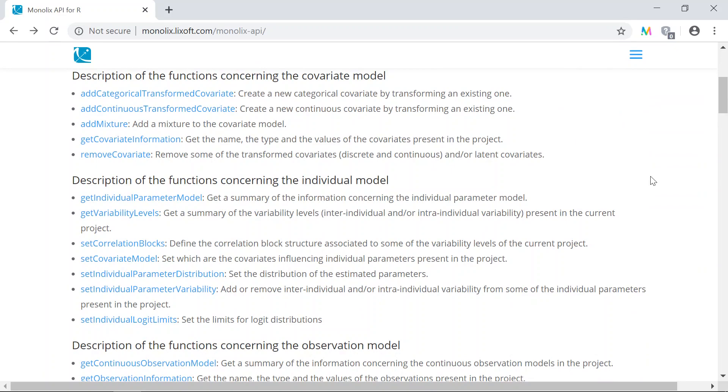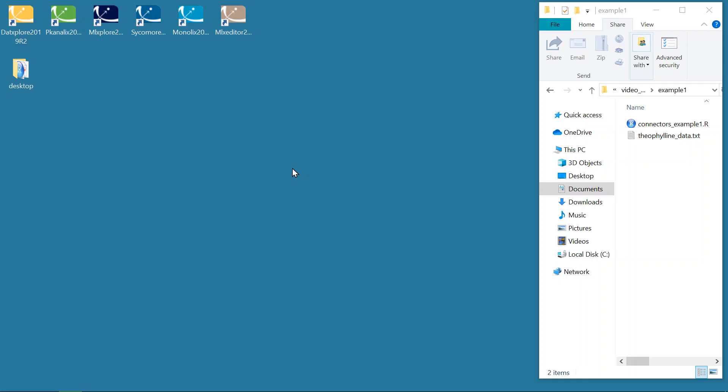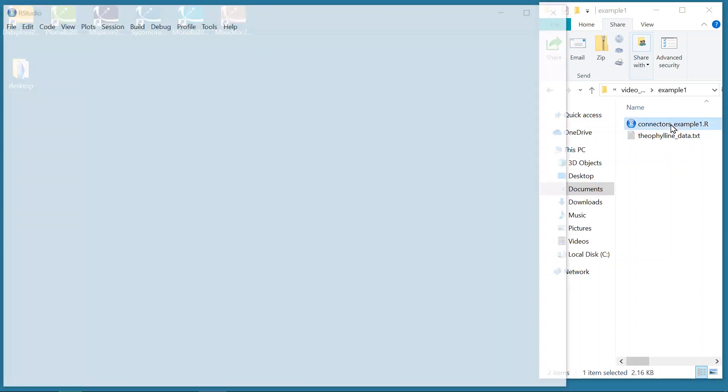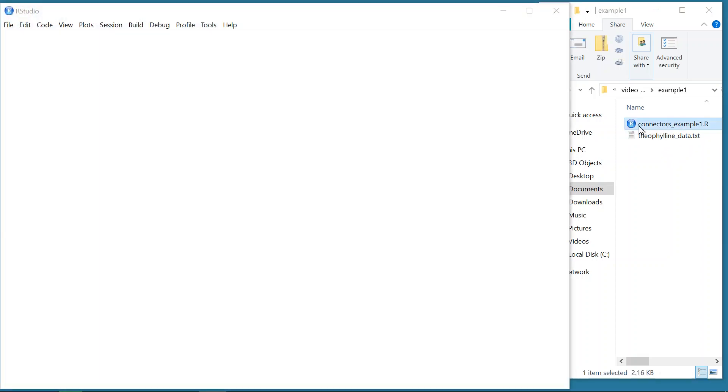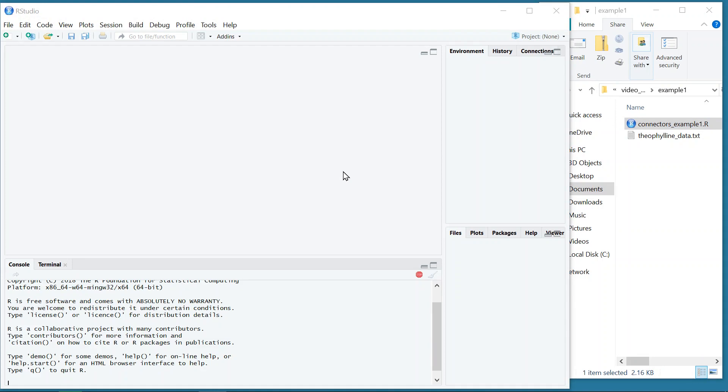Let's now see two examples in R. I have installed the package Lixoft Connectors in R, and I have written here a script with some instructions for Monolix. The script is going to create a new Monolix project using this PK dataset and a model from the PK library, and run the project to get the population estimates and individual estimates. I first open it with RStudio, which is a nice environment to write and execute code in R.